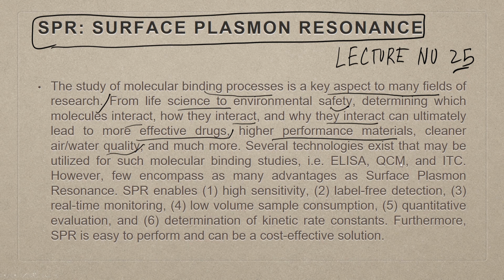Several technologies exist that may be utilized for such molecular binding studies: ELISA, QCM, we talked about this, and ITC. However, few encompass as many advantages as surface plasmon resonance, or SPR.